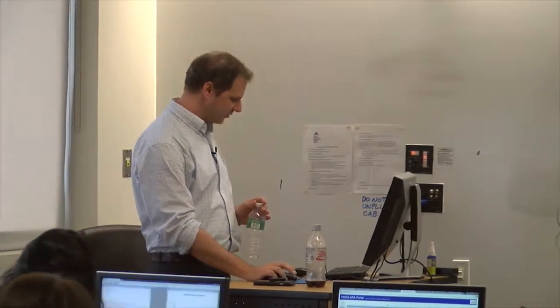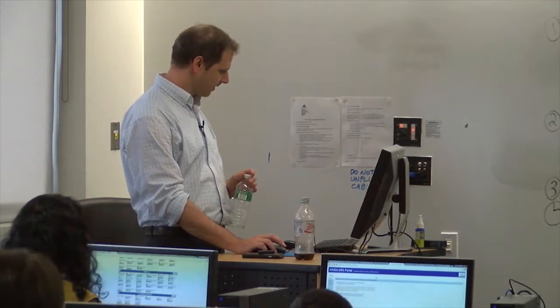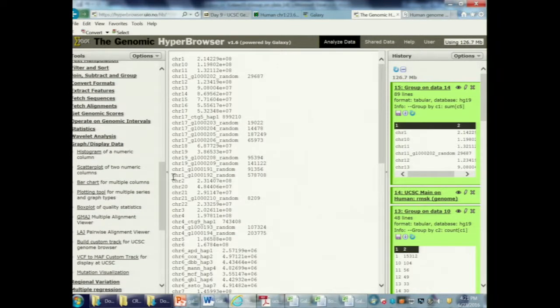There is a plotting function. I'm not very familiar with it. So yeah, graph display data. It will do histograms, and maybe with some of those things I threw into Excel, I think it will do that for you too. I've never actually played with that.